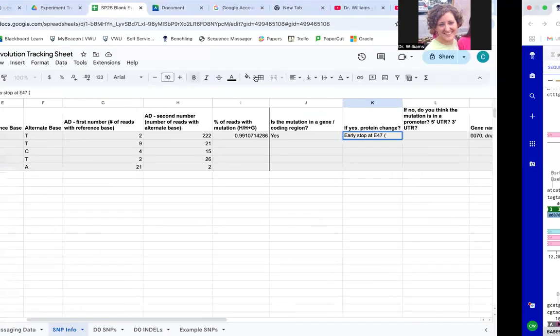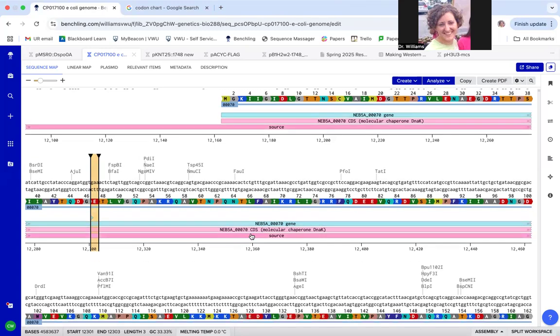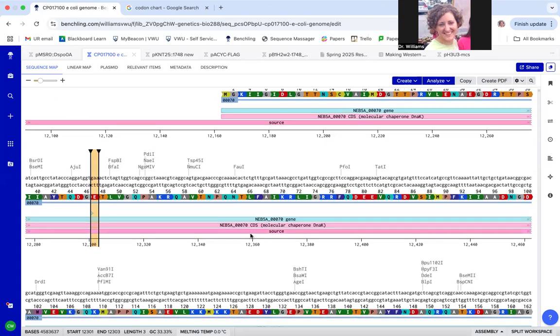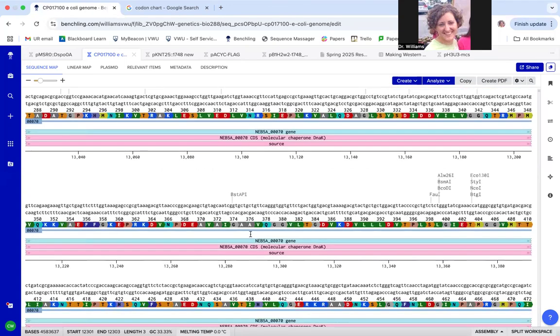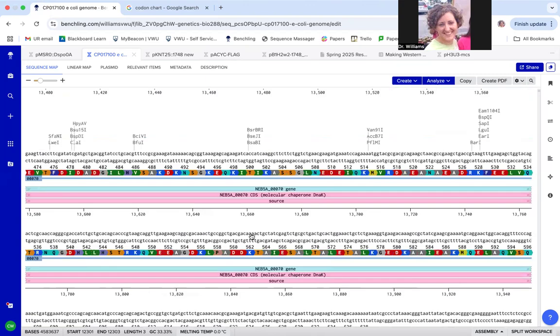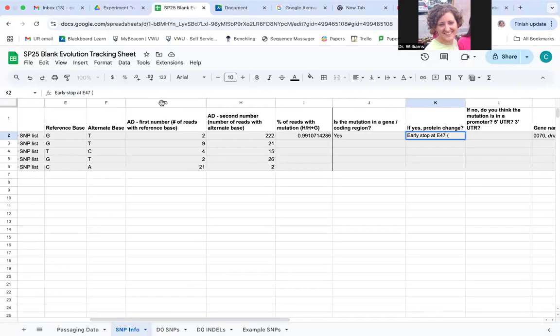And then just because it's interesting to note how far into the protein we stopped. Like, is 47 the end? Is 47 the beginning? How long is this thing? Oh, it's long. Oh, it's real long. It's 638. So very early stop.